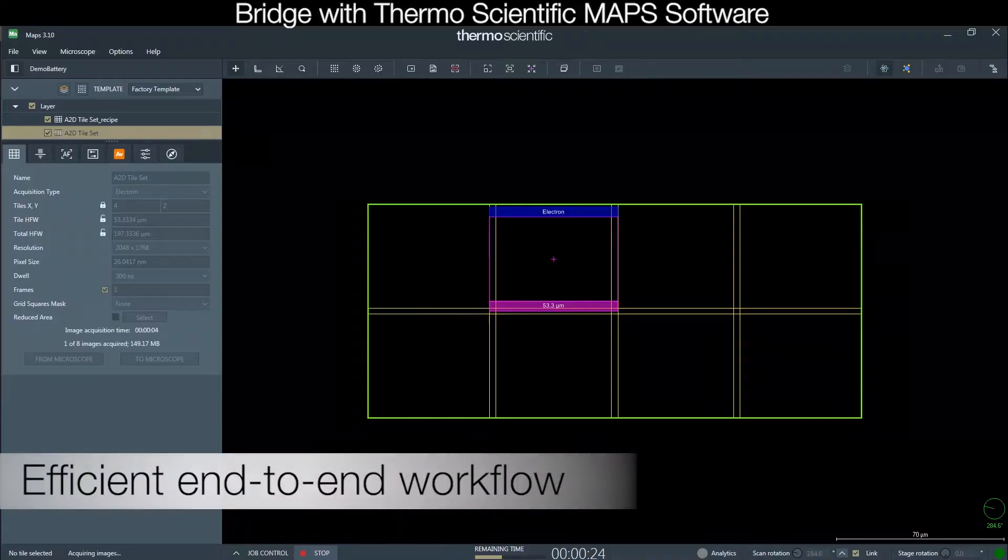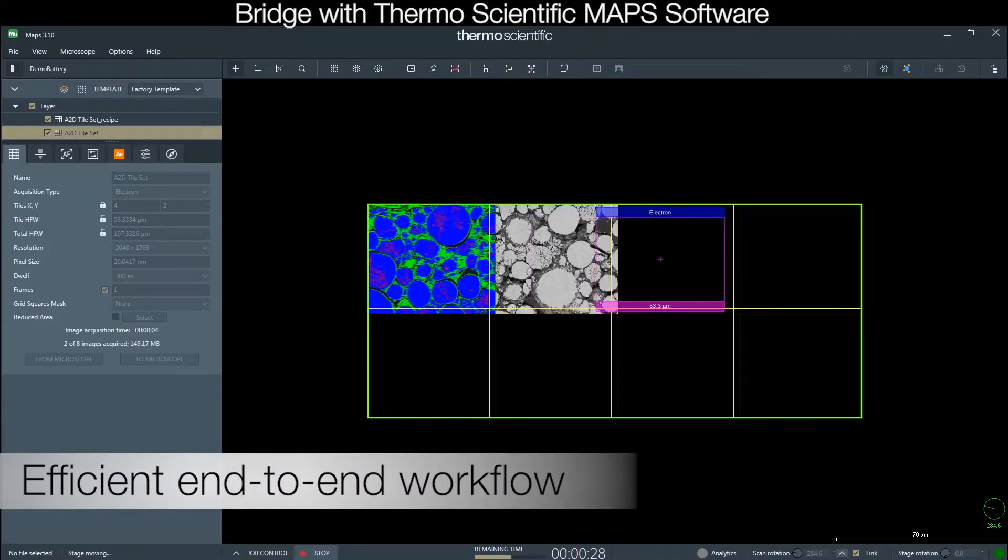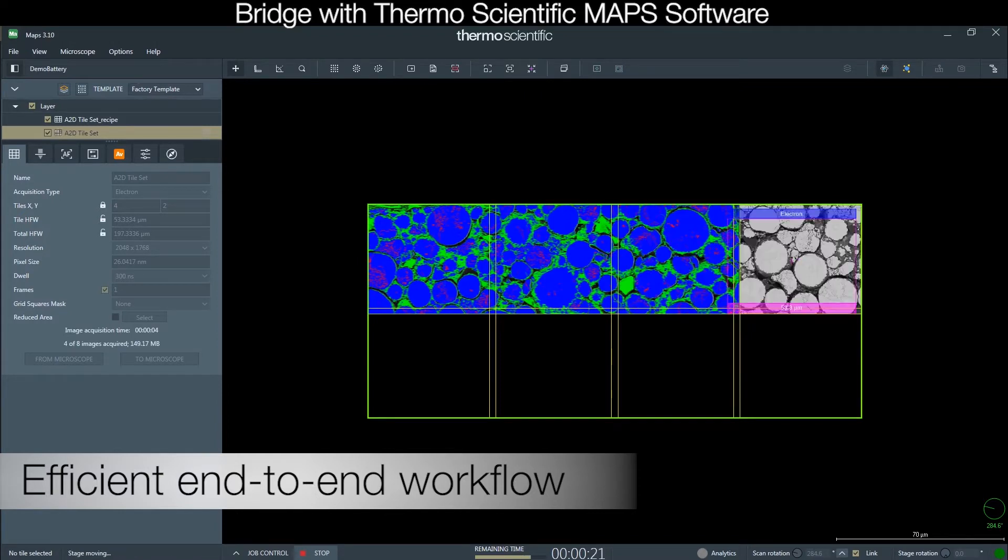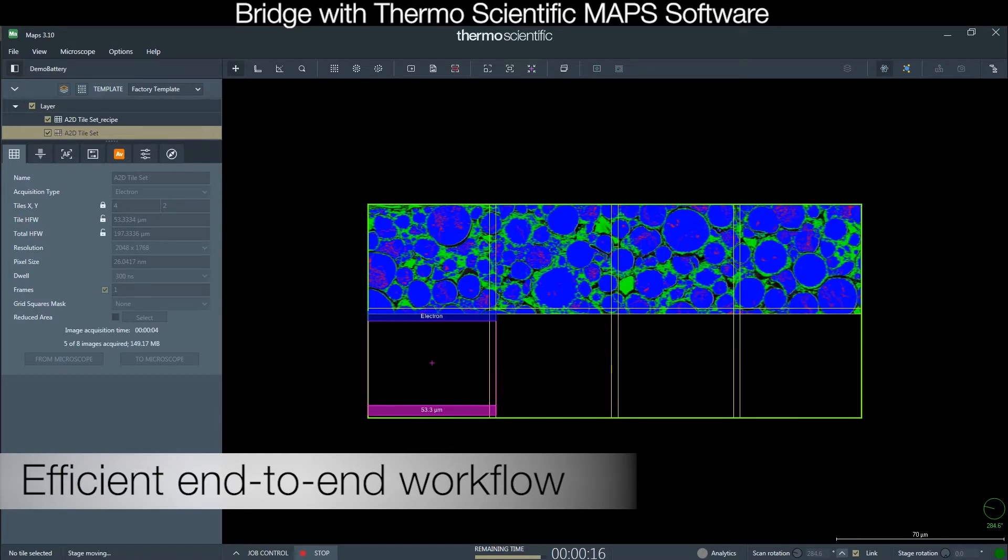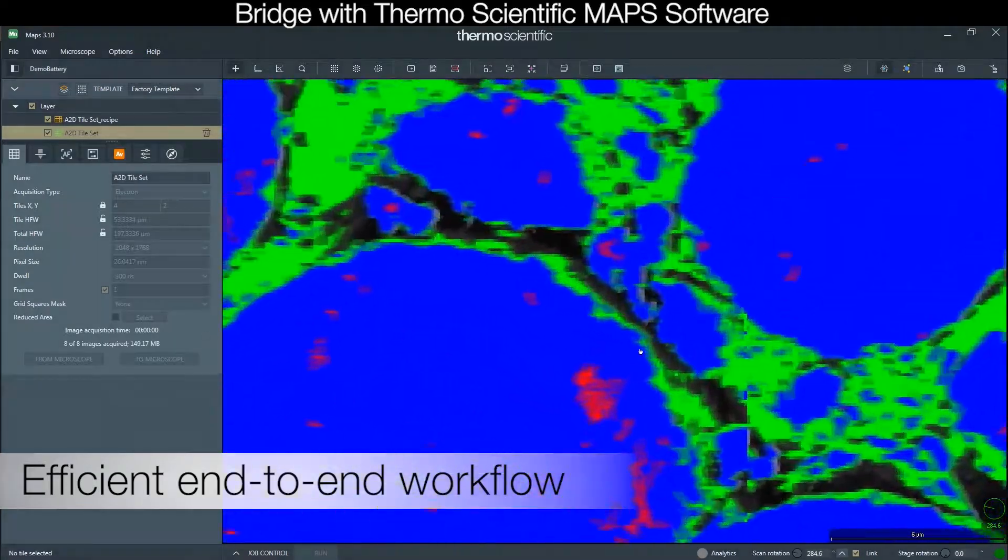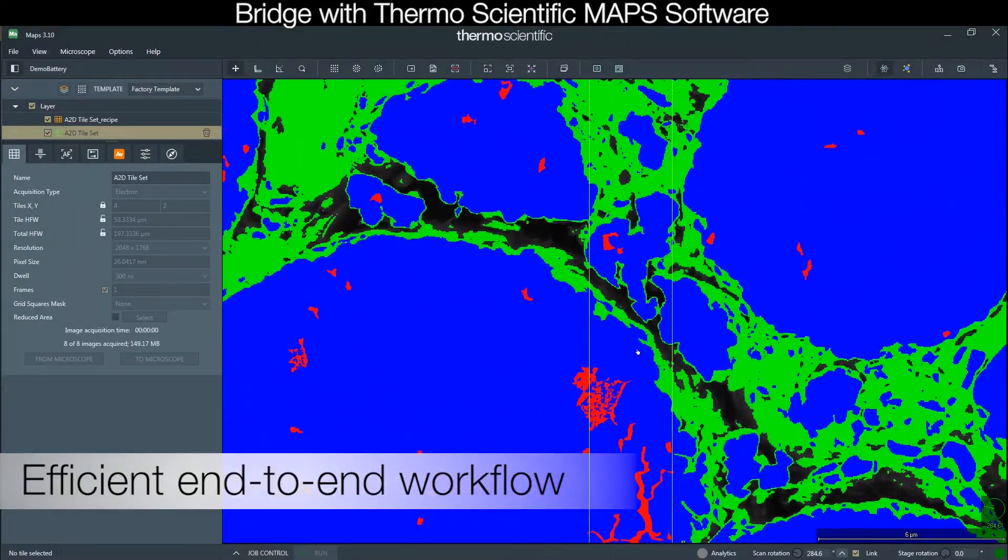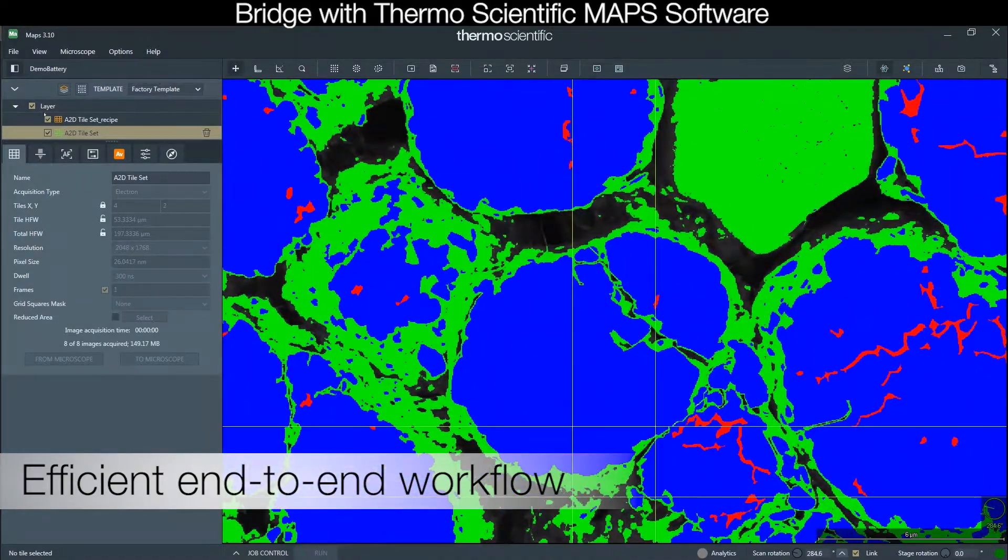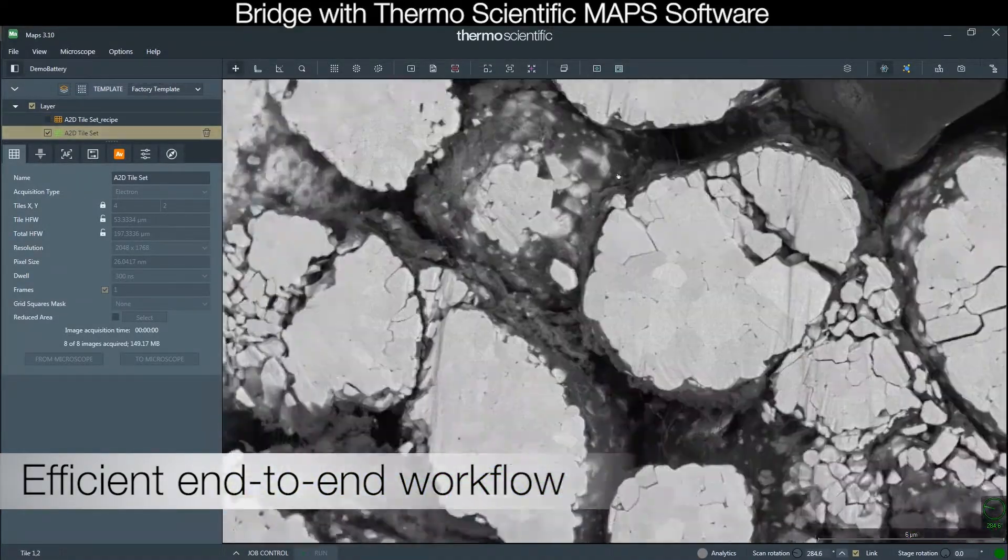Aviso2D software can be directly connected to your image acquisition workflow. This allows you to zoom in on regions of interest based on targeted metrics, to see augmented insight, and to receive quantitative information on your sample while working with the microscope.